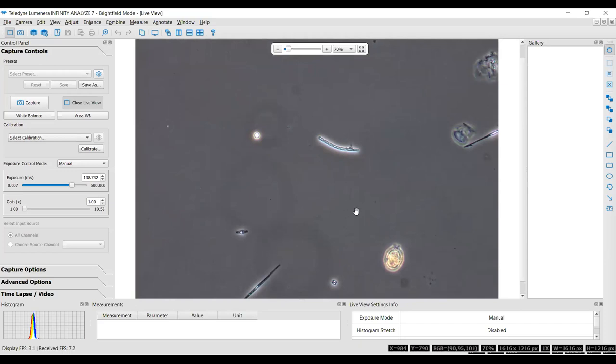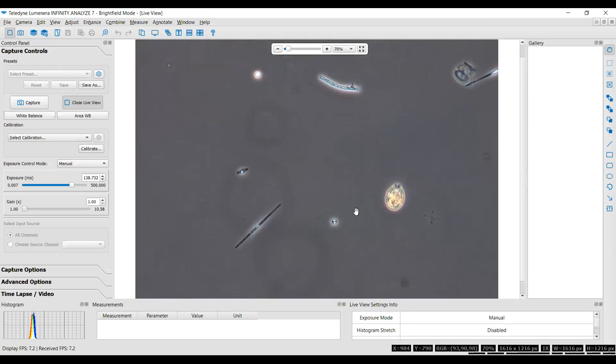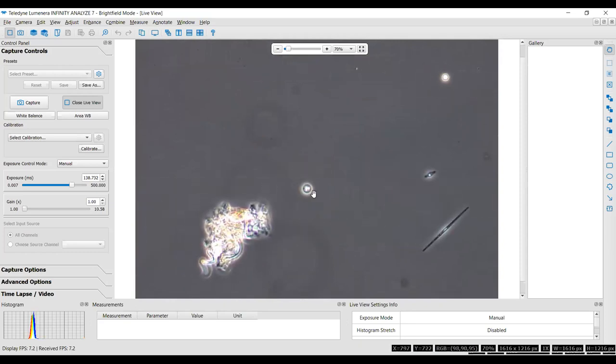That's another little diatom, which honestly I can't see enough of to know what genus it is, because there's too much I can't see. What's going to determine what it is is whether it has spines or not, and whether it's flat or not. I'm going to see if I can get it to flip. What I did was just hit my slide with a pen, low tech, but it works. So this is a little centric diatom, and it does not have spines. So it's probably either a Pantocsekiella or a little Cyclotella, and it's not in the Stephanodiscus or Cyclostephanus group because it doesn't have any spines. By flipping things, you can tell, oh hey, now I have a better idea.